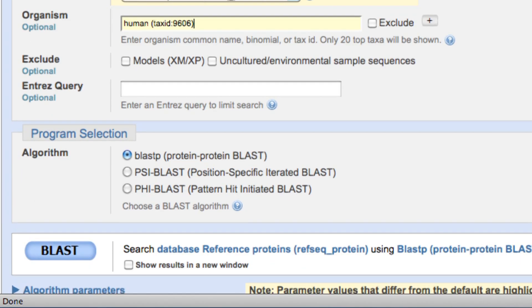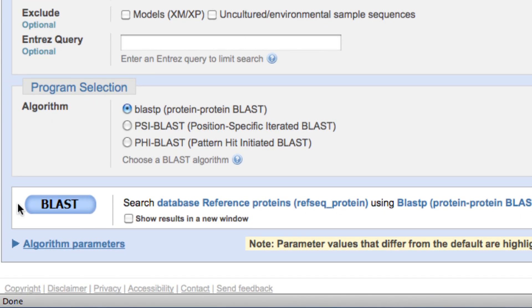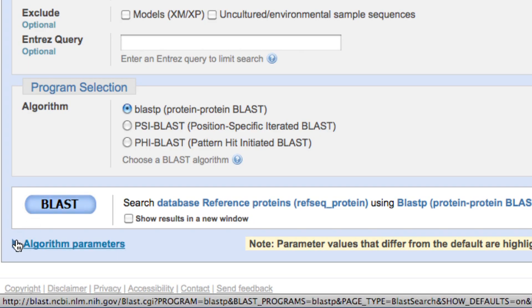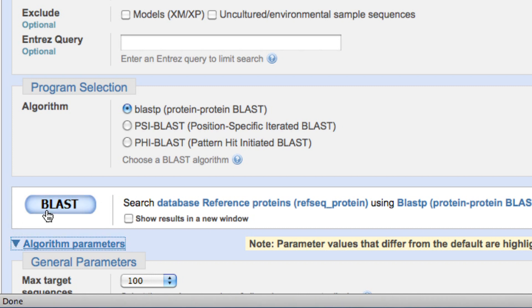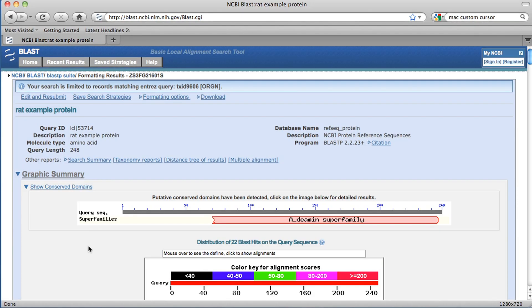Scrolling down just a little bit further, the BLAST button will start the process. If I expanded this tab by clicking here, it will open some advanced parameters. If you were more familiar with advanced BLAST parameters, you could adjust those, but we're not going to do that in this exercise. I'm just going to go right ahead and click BLAST, and I have got my output relatively quickly.